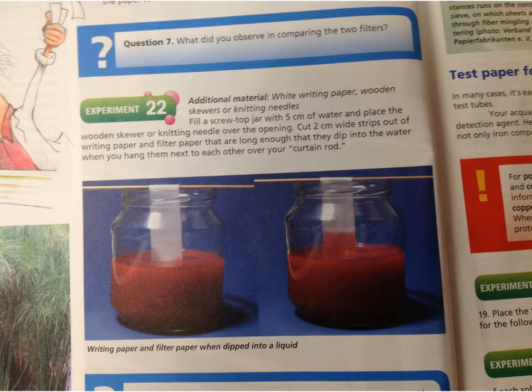Let's take a look at some different parts of the experiment here. First of all, you're going to have to use filter paper again. If you haven't done so by now, you're definitely out of the filter paper that's come with the kit. So go to the store and buy coffee filters. They are super cheap. I believe I paid $1 and I got like 200, and that was at Kroger's. I didn't even have to go anyplace crazy. So you need some coffee filters in order to get your filter paper.